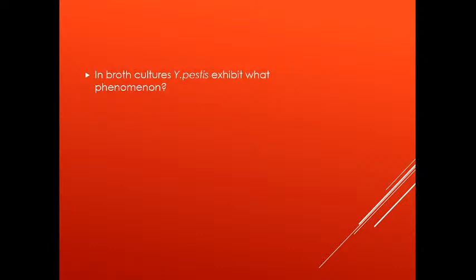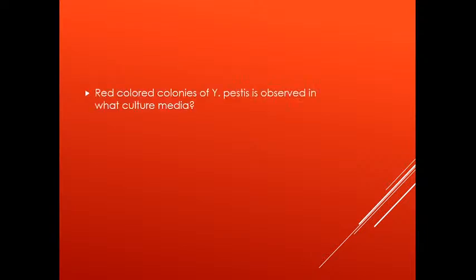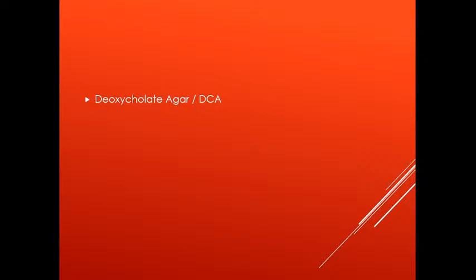Now, broth culture media exhibit what phenomenon? This is known as the stalactite formation. So, also known as stalactite streamers. Okay? The stalactite formation when you culture it in broth media. Okay? And we have red-colored colonies of Yersinia pestis observed in deoxycholate agar or DCA. Okay?